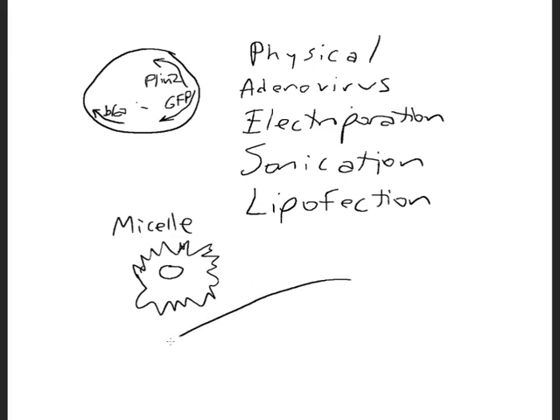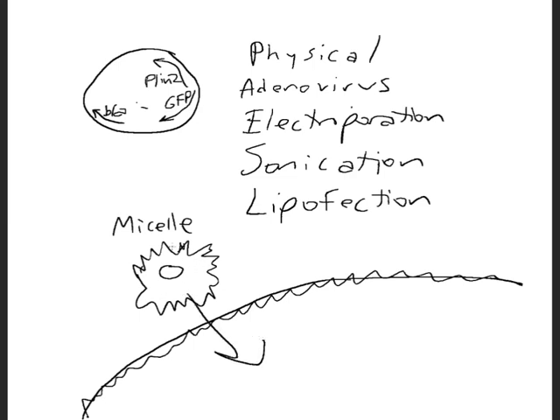And then when you incubate these with the cells, here's the cell membrane here that is also a phospholipid bilayer, it actually just allows this to enter right in, almost through endocytosis, where it'll recognize this and just pull it in and bring that into the cell, and then the cell will actually start transcribing and using the information. So this is a very, very good method, very simple to do. All you have to do is essentially combine the plasmid with the reagent, let them sit for a couple of minutes.